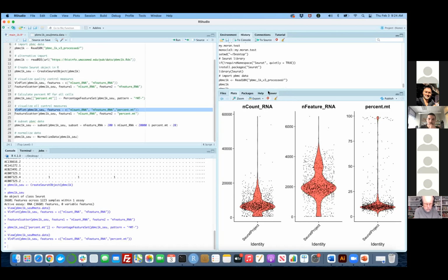Maybe 20%. No, great. And how do you understand that, Alicia? Just looking at the dots, the majority of them are situated in the thicker part of the plot. So it's under the 25, but maybe making it even a little more stringent and putting 20, but perhaps 25 would be a good starting point. I don't know. Yeah, okay.